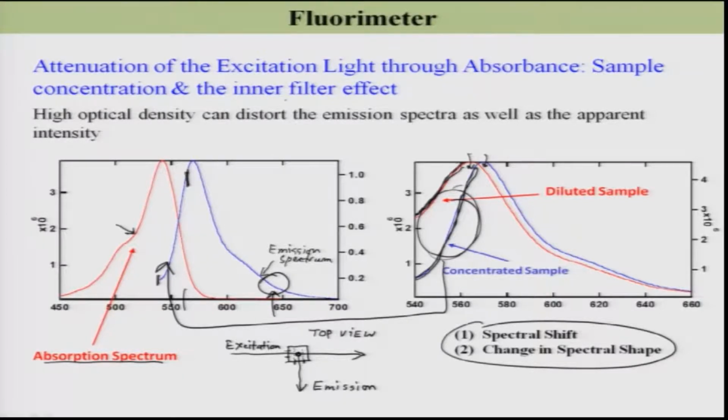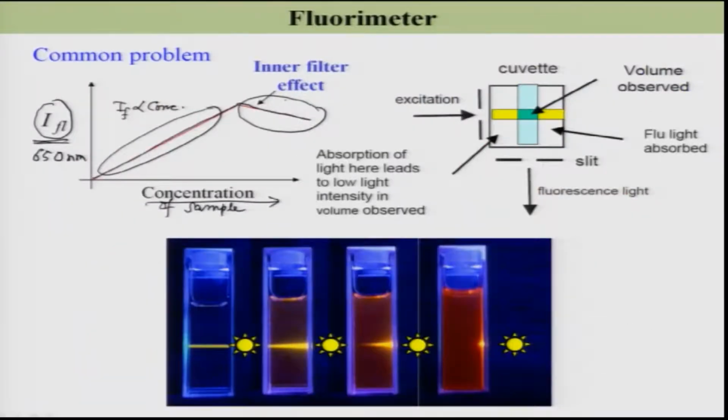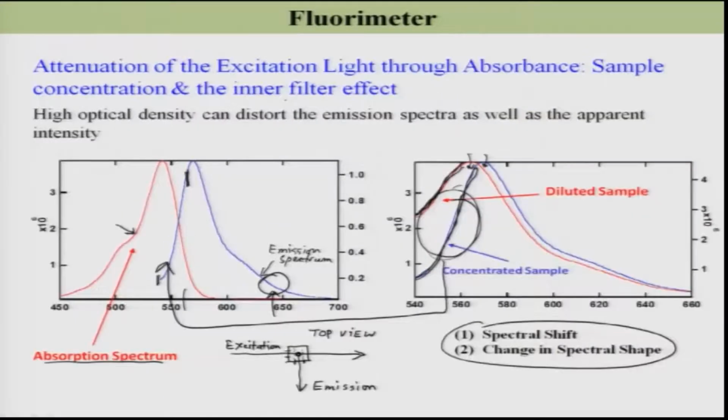So, in this particular experiment, I have set the excitation wavelength as, let us say for example, 520 nanometer excitation and let us say 650 nanometer emission. Please note it, I will highlight it.